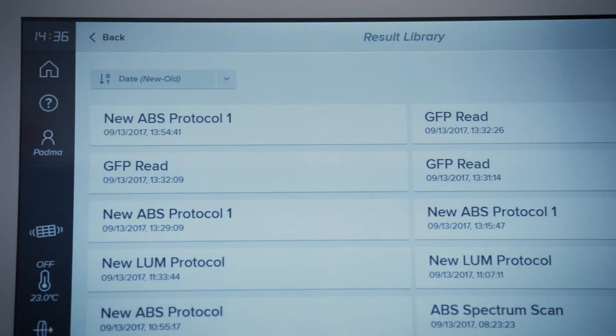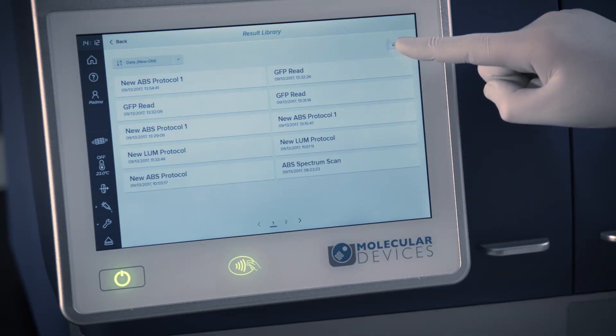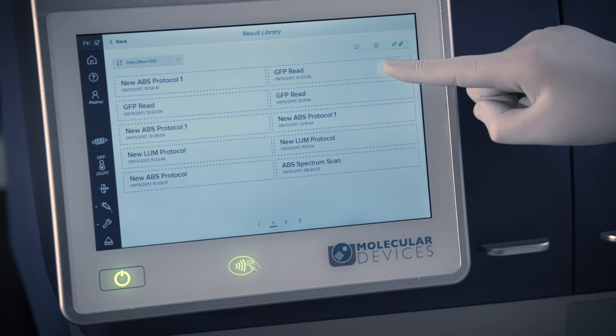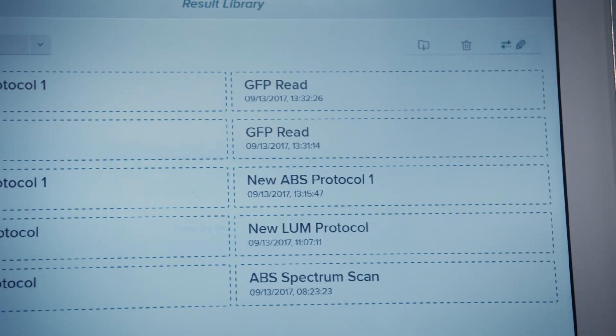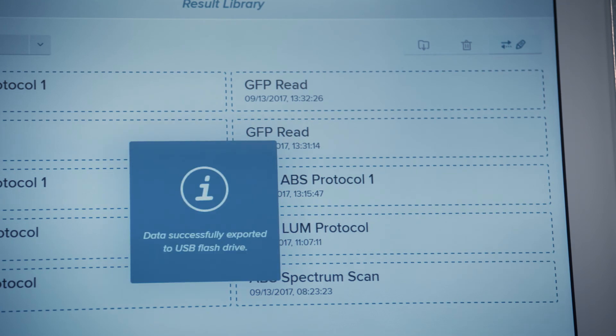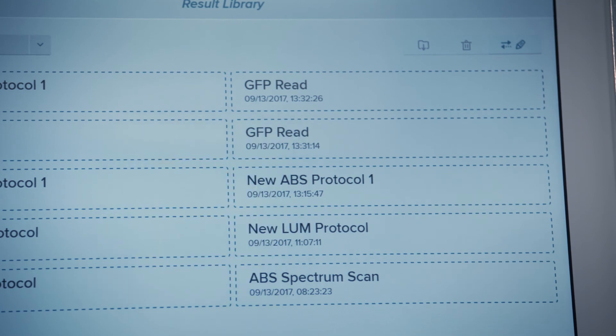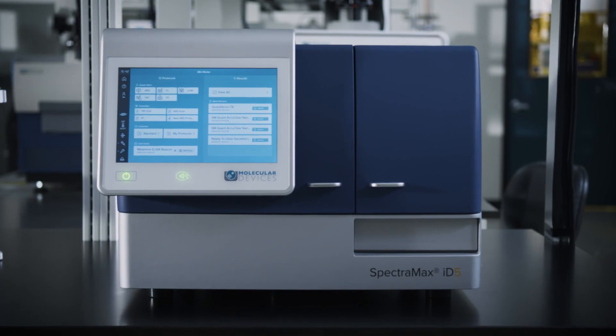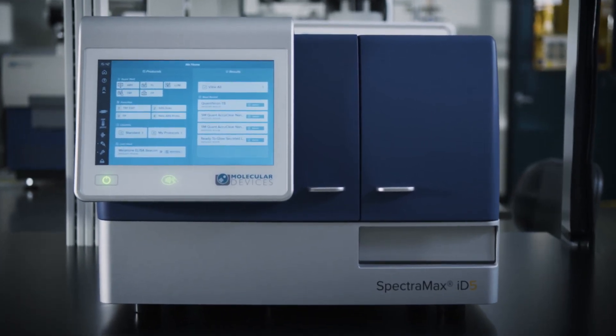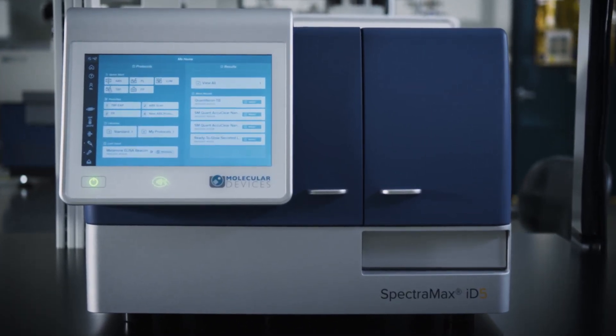To manage your results, touch the pencil icon. With the additional options, you may delete files or export the results in XML format to a USB drive for additional analysis using any spreadsheet program or using the included Softmax Pro data acquisition and analysis software.